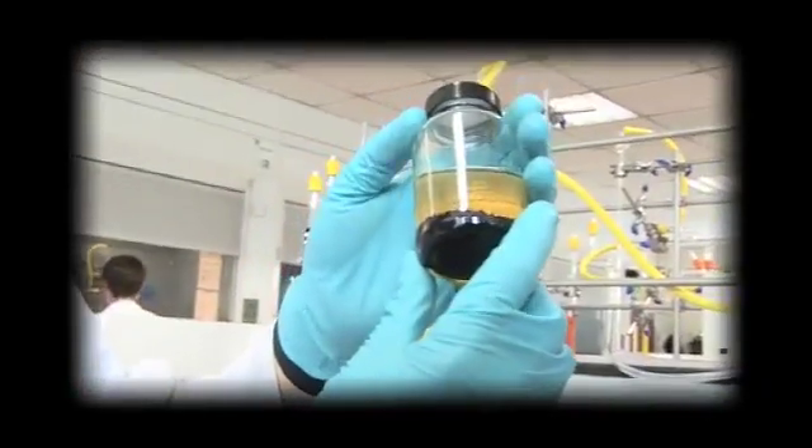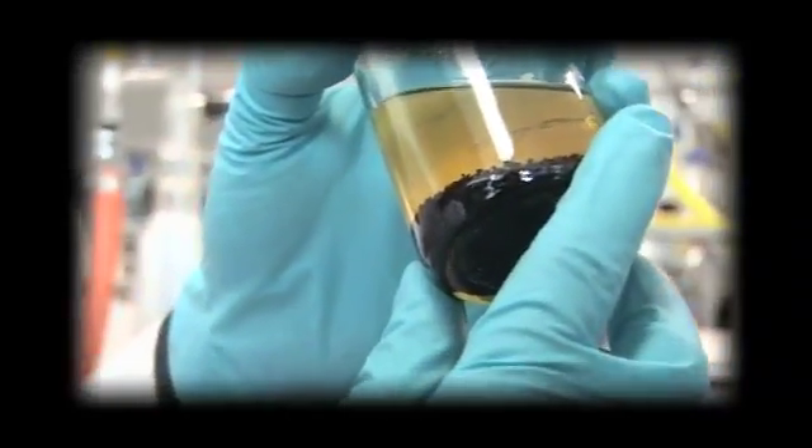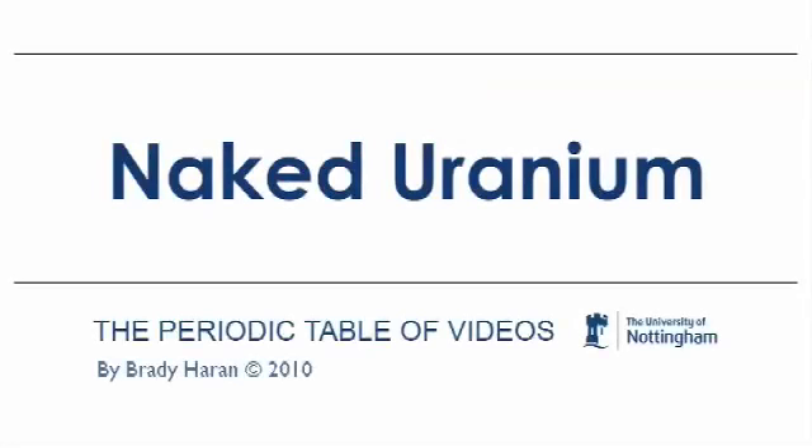So this afternoon I thought it would be a good thing to do to show you some uranium. In several of the videos previously you've seen various forms of uranium, and one of them was just the metal, but it always appears black because it's got these oxide surfaces on it. Actually, uranium, just like lots of other metals in the periodic table, should have a shiny silvery appearance. So I'll take this opportunity, we'll go in the lab, clean some up, and I'll show you some actual naked uranium, because it's really very pretty to look at.